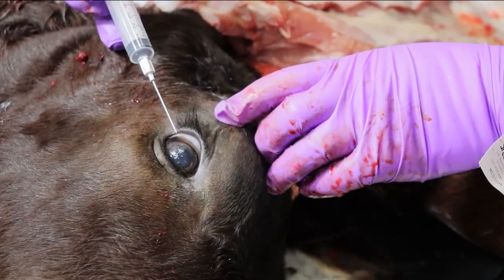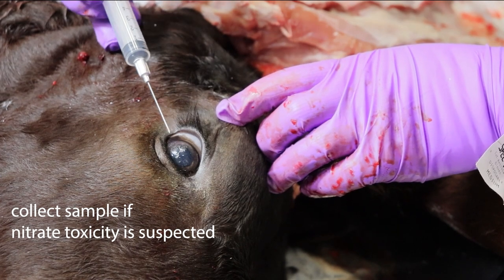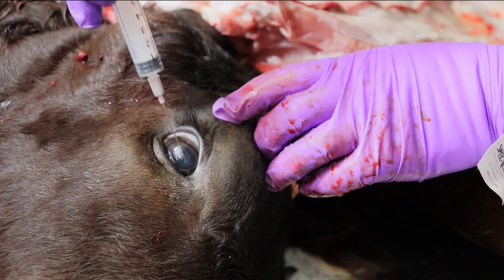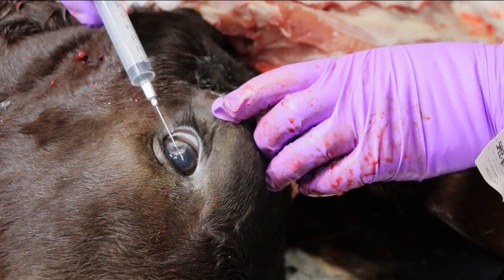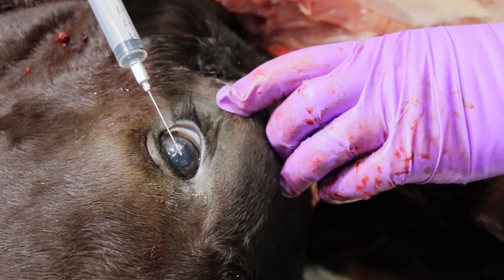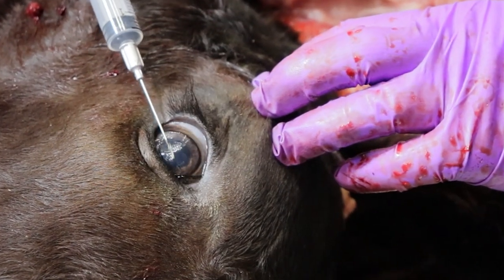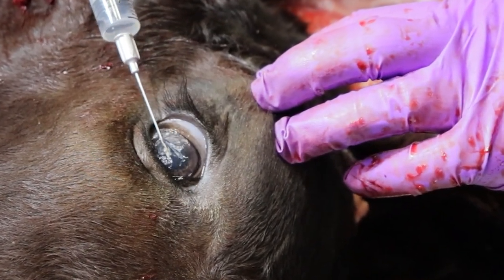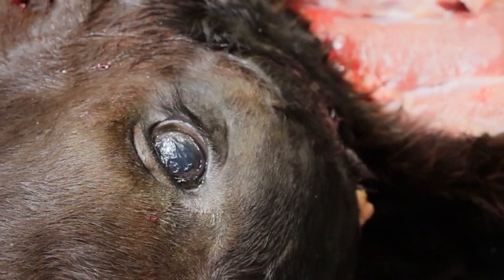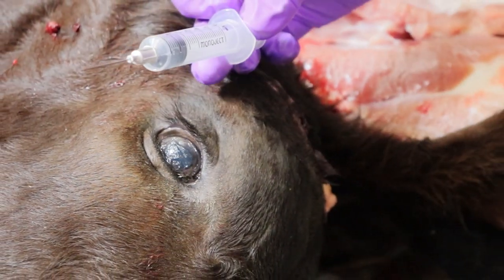The ideal sample for some toxicologic testing is aqueous humor. In order to do that, you're going to do a superficial puncture through the anterior chamber of the eye. You can see that this is really on the surface of the eye — you can even see the tip still there in front of the iris, or the colored portion of the eye. Withdraw that clear fluid and submit it in a red top tube.